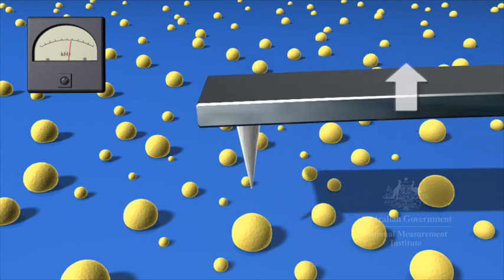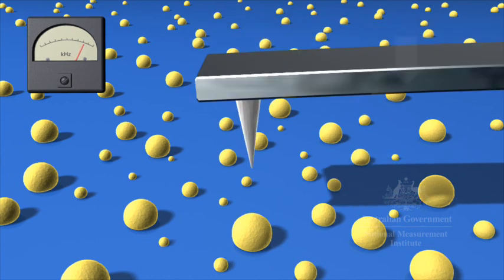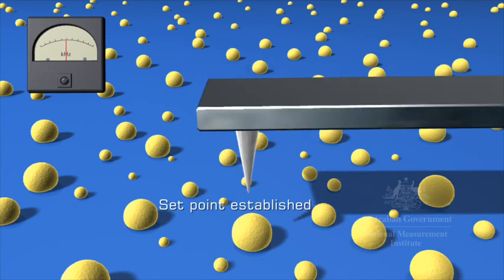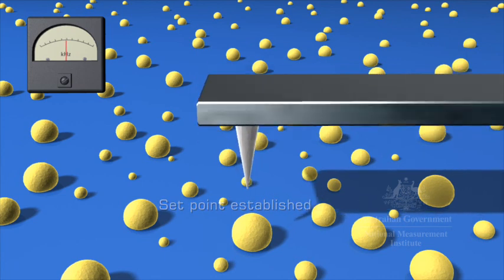The cantilever returns to its unperturbed vibration when withdrawn from the sample. The set point for the cantilever vibration determines the distance between the tip and the sample for imaging.